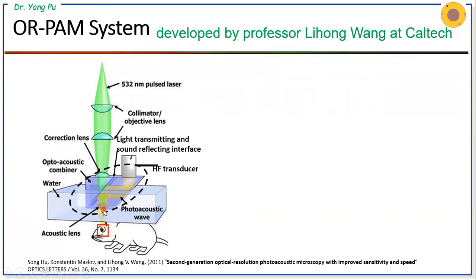At the interface, the acoustic impedance is solid in the prism and liquid in the gap, which are highly mismatched. As a result, the acoustic wave will be reflected to the transducer here. This component is much like a beam splitter, except that here it involves two forms of energy, light and sound. This is the so-called optical-acoustic combiner.